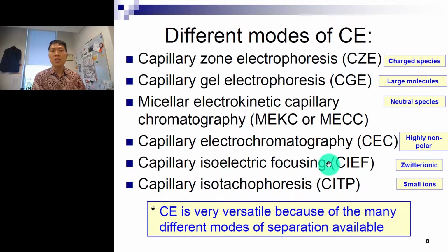So next we have also the capillary isoelectric focusing, the CIEF, which is for zwitterions. Zwitterions, for instance, exist like your amino acids, right? You have your carboxylic acid group and your amine group, and then you switch the H plus ions to become charged particles. And when you become a zwitterion, it becomes a bit problematic because the overall charge is the same as before, right? But the charges are on different sides. So how does it affect the movement?